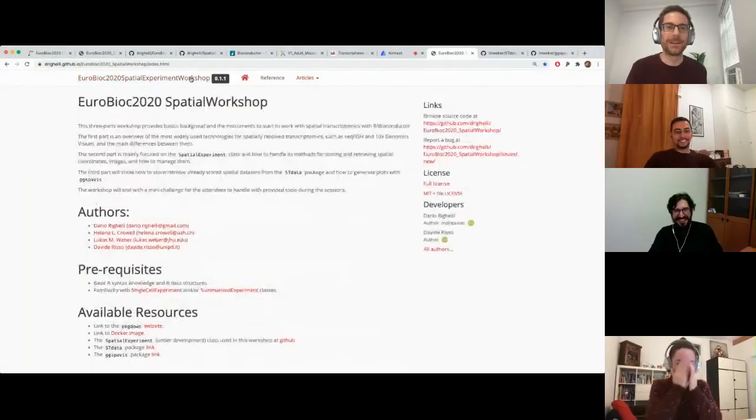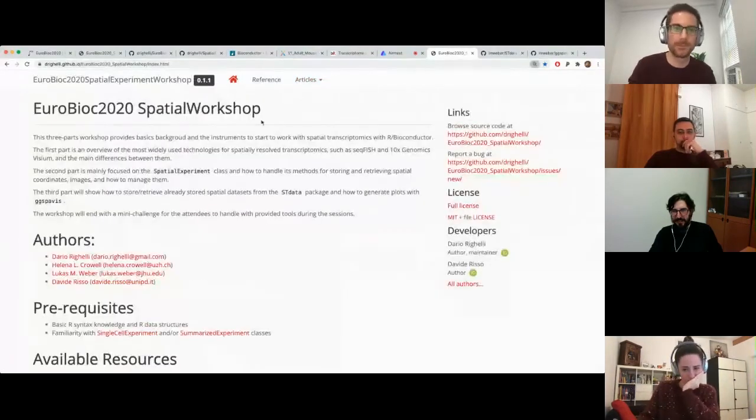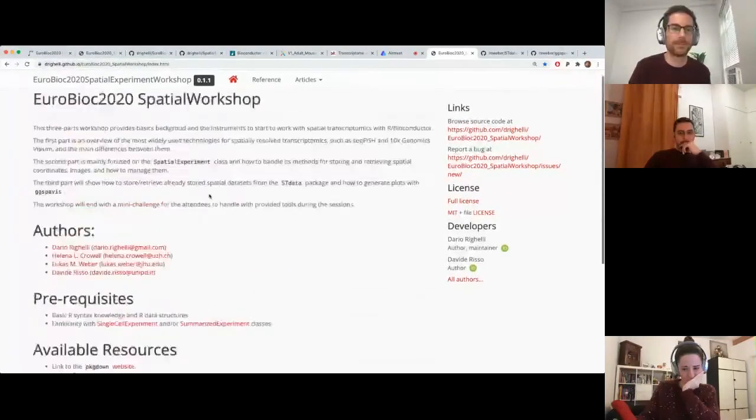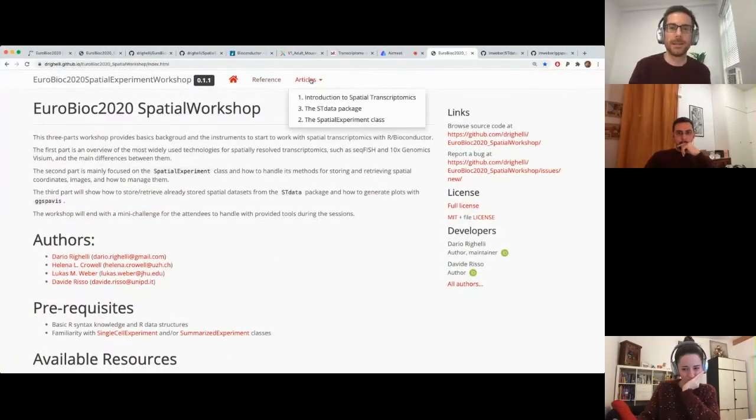All right. So here I've just gone back to the website, and I'll just show you again. At the top here, you can see my screen. This is Chrome. I've got the BIOC Spatial Experiment Workshop website up. There's some information here on how to install it. Then in this articles tab up the top, they're actually out of order.